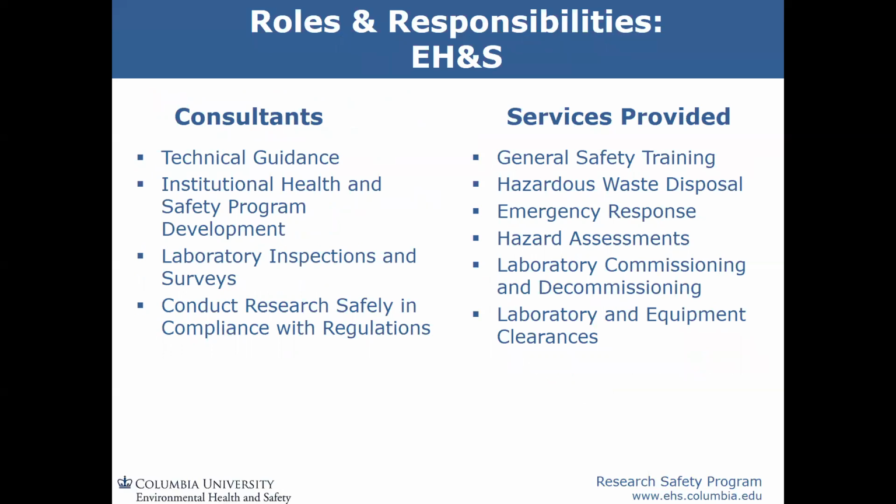Okay, so roles and responsibilities of Environmental Health and Safety. We can act as consultants for technical guidance, institutional health and safety program development, laboratory inspections and surveys, and conducting research safely in compliance with regulations. Services provided: general safety training, hazardous waste disposal, emergency response, hazard assessments, laboratory commissioning and decommissioning, and laboratory equipment clearances.